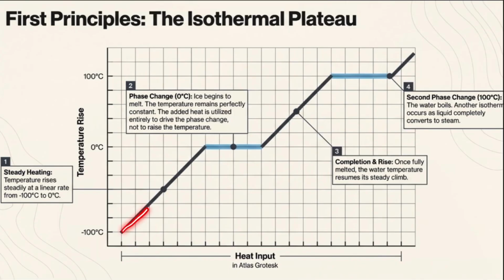As the temperature increases, the heat content of the pan or the container in which this ice cube is present also increases. Here we are linearly increasing the temperature, giving the heating input from the furnace, so the temperature of the system or the container is rising.